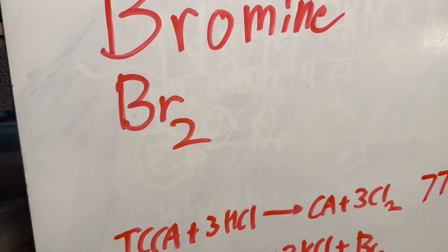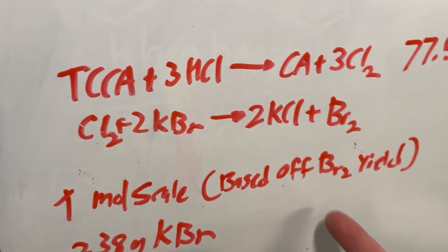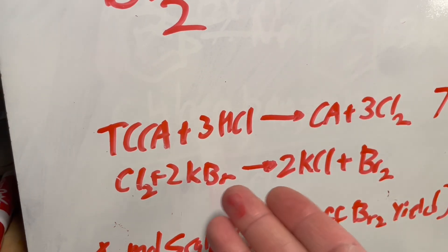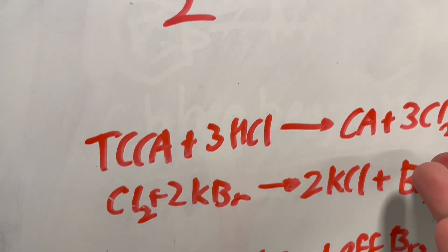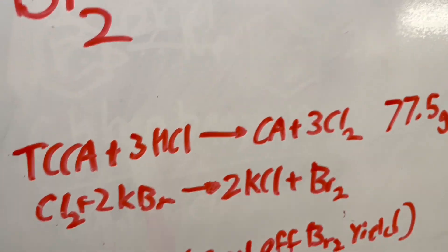Hello everyone. Today we'll be synthesizing bromine on a one molar scale, which means we're going to get one mole of dibromine. We're using the classic TCCA plus bromide plus hydrochloric acid method, and pretty much this just makes chlorine in situ. Chlorine then reacts with the potassium bromide to form potassium chloride and bromine.